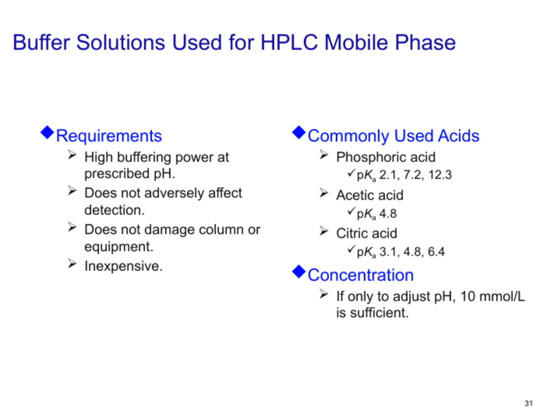Moving to the requirements for these buffer solutions, there are a few key points. First, they should have high buffering power at the pH you need. This ensures stable conditions during your analysis.